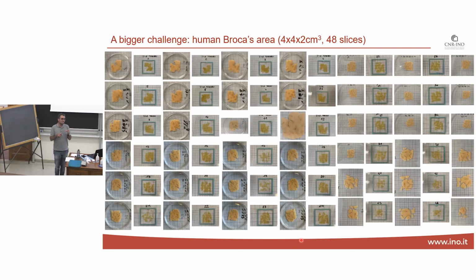I'm speaking about file names or file formats, compression. These days we are in the process of converting our data sets to a format that is suitable for NeuroGlancer. NeuroGlancer is a way for people to navigate the data set in 3 dimensions. But in order to do this, and to take advantage of the parallelization that is enabled by the cloud, one thing is to store your data set in a pyramidal format in the same file, like a H5, for example.